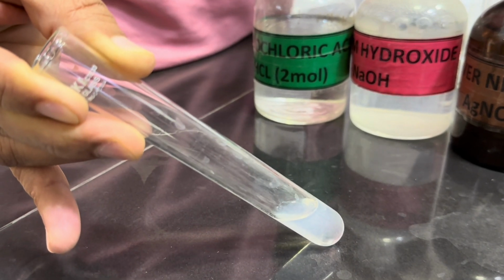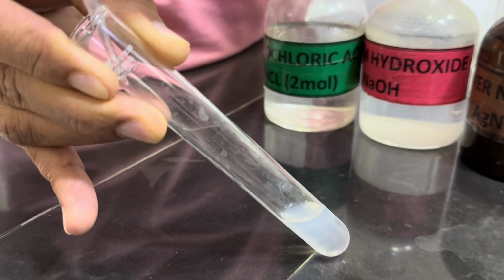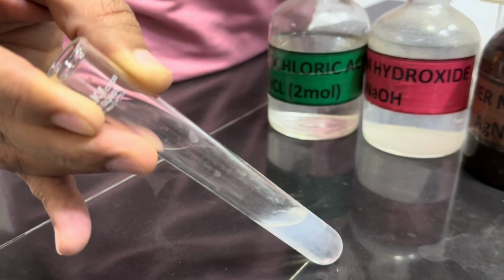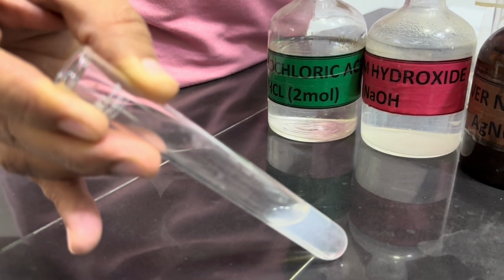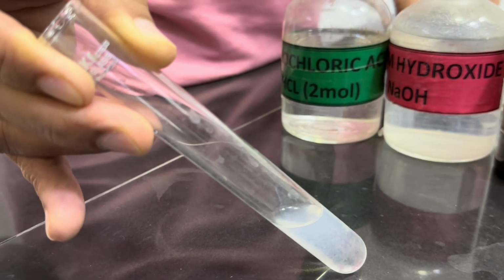If we add extra, means excess, we can see those precipitates are not dissolving. It means white precipitates which are insoluble in excess.